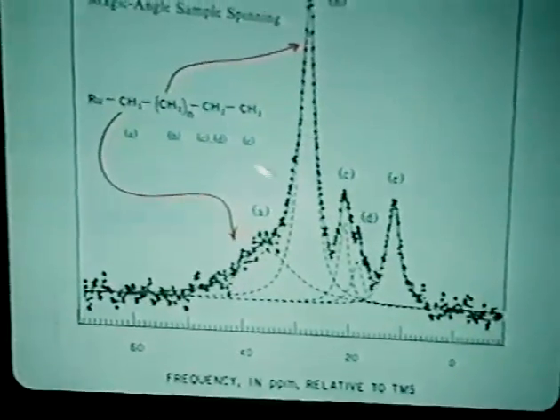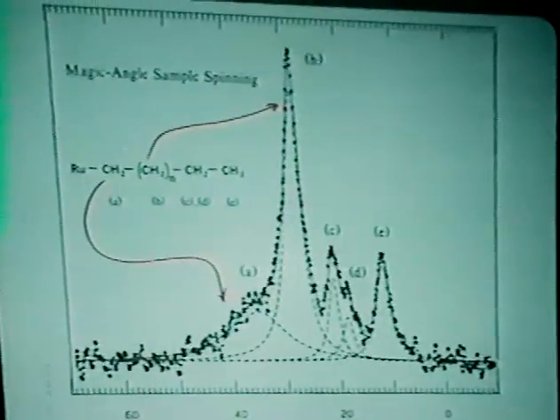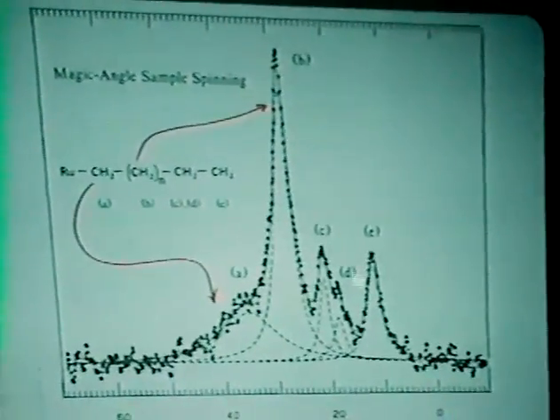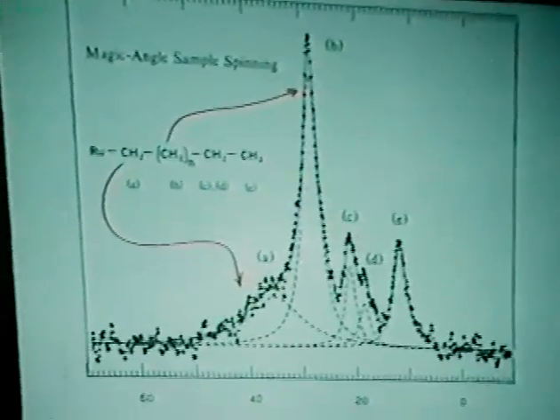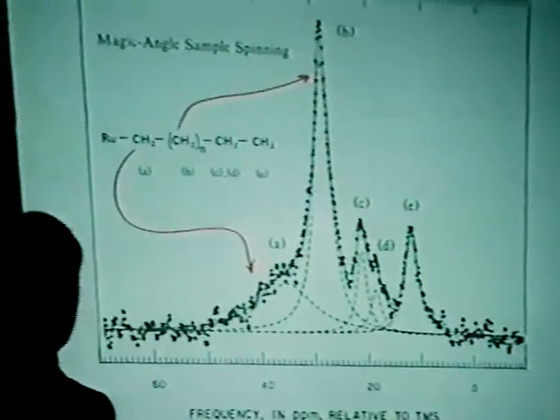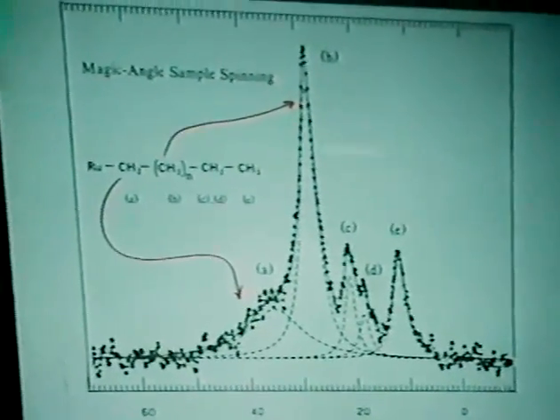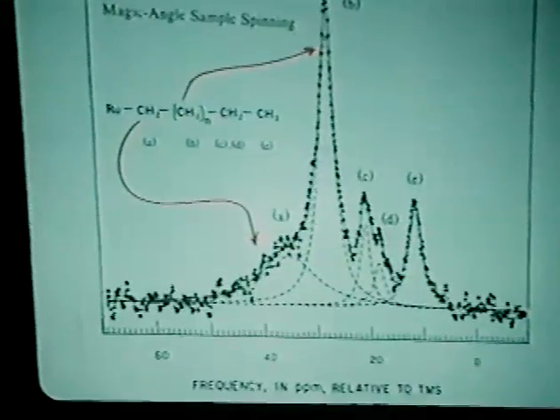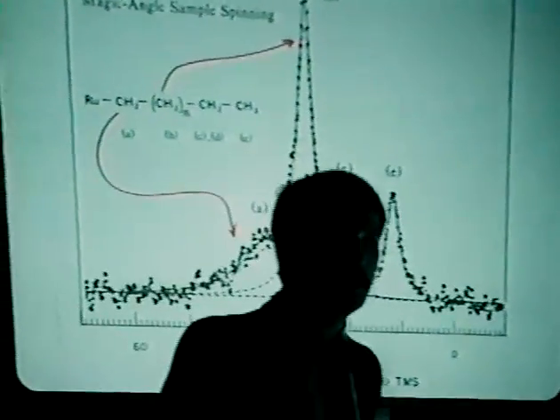What we can get from here, as I conclude, is that from this you can directly determine the length of the alkyl groups on the surface. That is, you know the amount of terminal groups here. This is the methyl. If you then just calculate the length of this one here, you then know the length of your alkyl groups as your sample runs. This was after 5 minutes of reaction. We have an N that's approximately, I think, 4.5 after this short reaction here. With that, I conclude. Thank you for your attention.